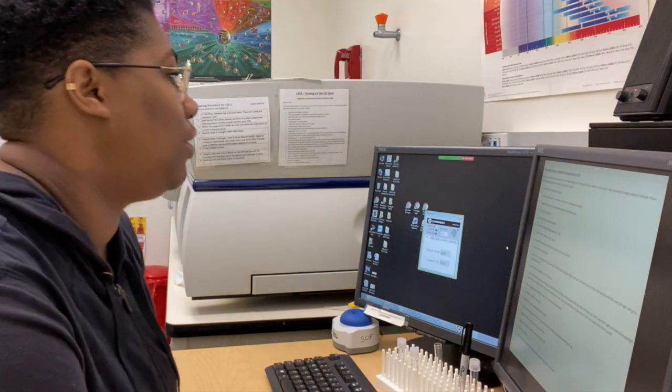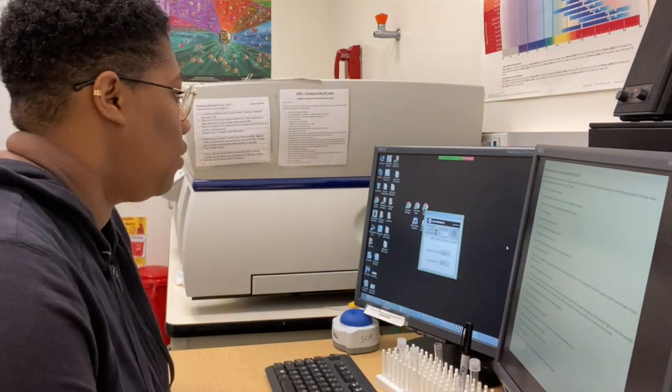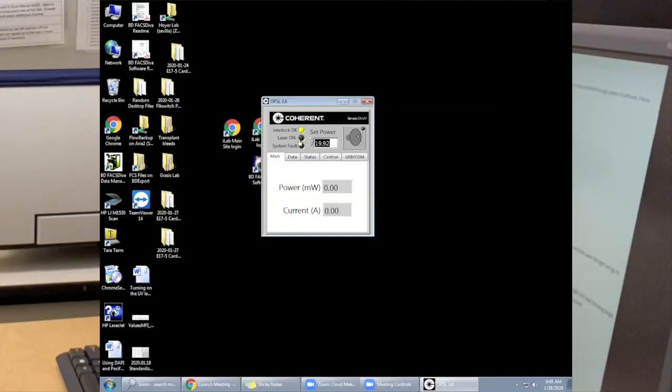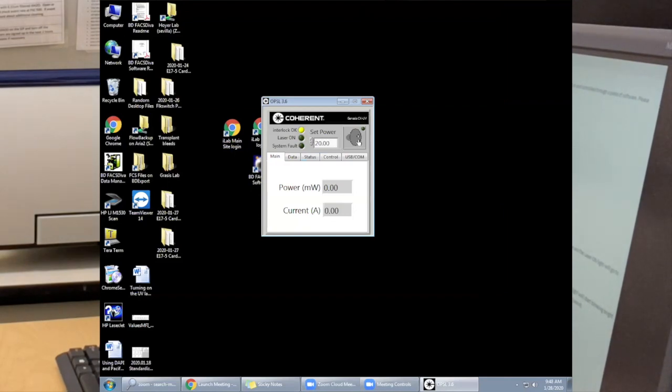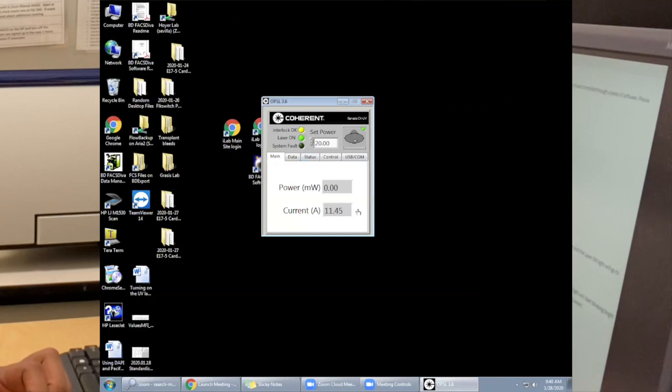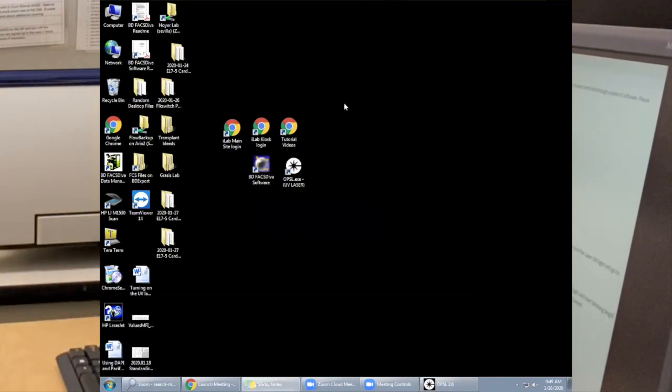When looking at the screen, you want to make sure that you set the power to 20 and click this knob. You'll see the green light flashing. After a couple seconds, you should see the current change and the power go up. That looks good.